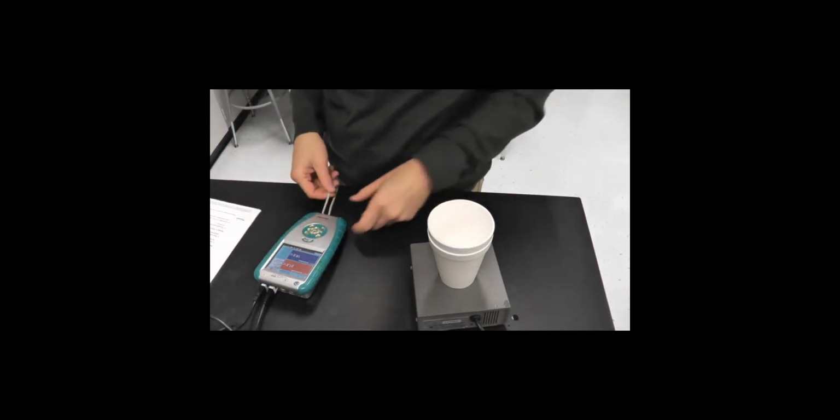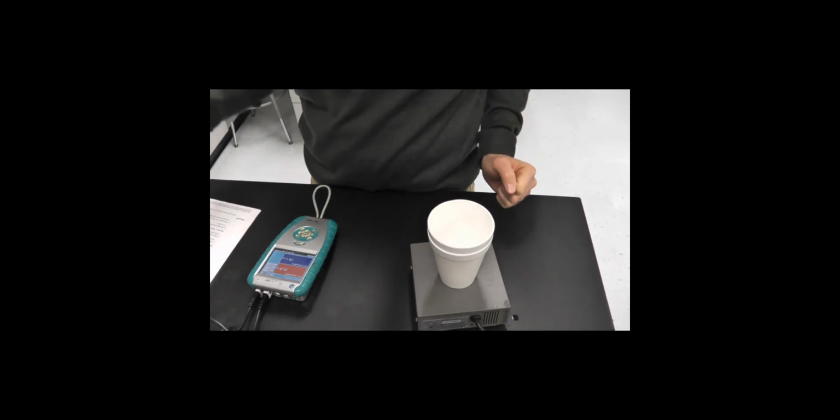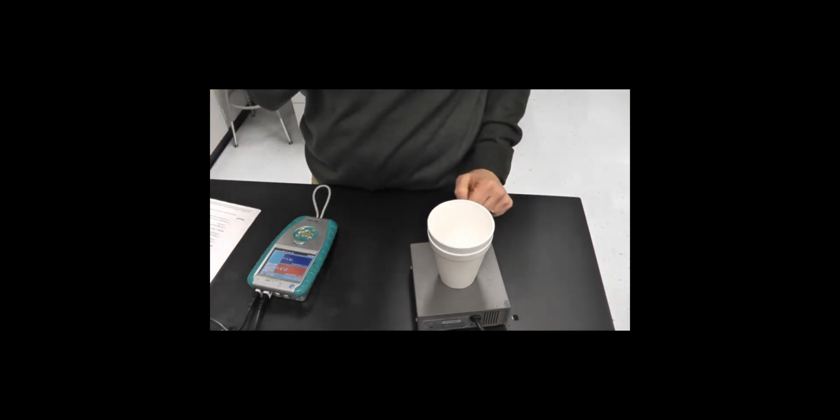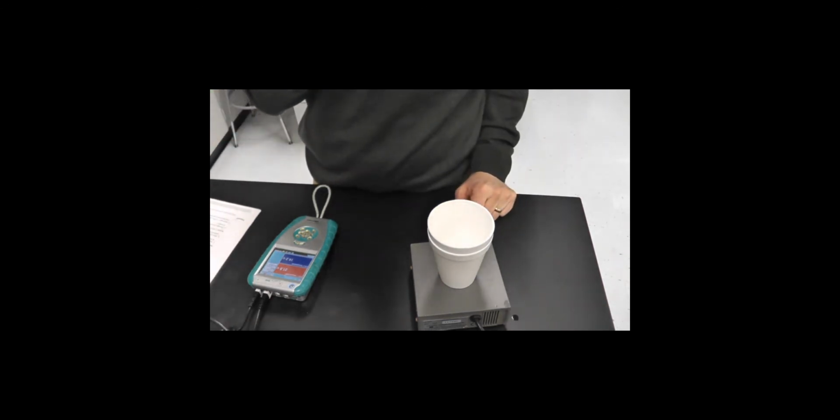So I'm going to go back to my data, and I just took temperatures of my HCl and NaOH. HCl was about 21.3 degrees, and my NaOH was about 19 degrees. What we're going to do with those two temperatures is take the average of those initial temperatures to become our initial temperature. They should be pretty close to each other, and that's a little further than I would expect, because they were both just sitting in the room. I'm not sure why they're 2 degrees off, but I think on the data you'll get, they'll be closer than that.